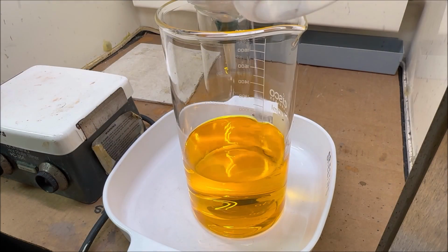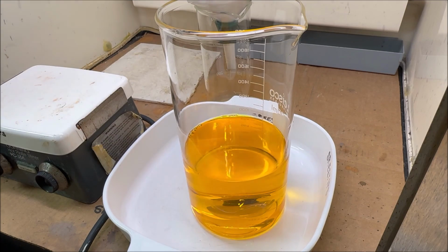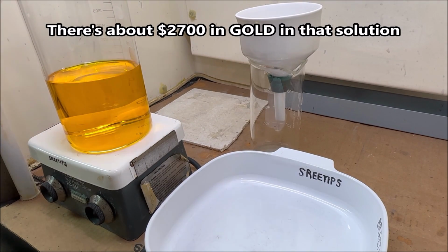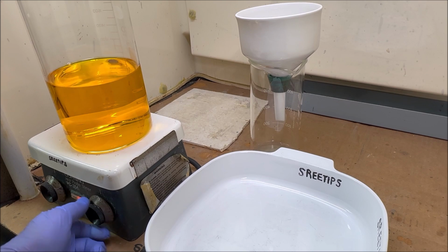Now we'll take my gold solution. We're going to put it over here on some heat. And we're going to evaporate this down as a little experiment here.